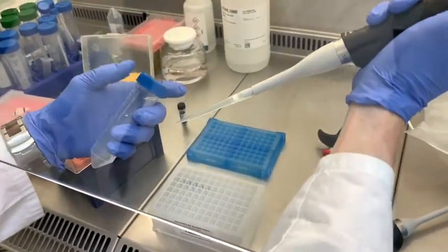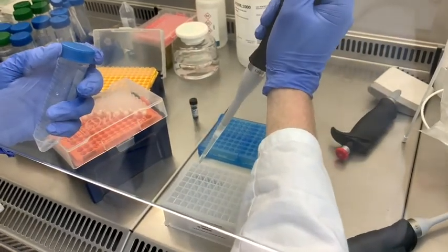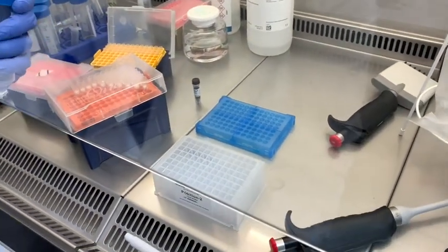Let us pretend this solution is the specimen. We will pipette 250 µL into each well, without mixing, as the mixing will be automated in the N96 extractor.